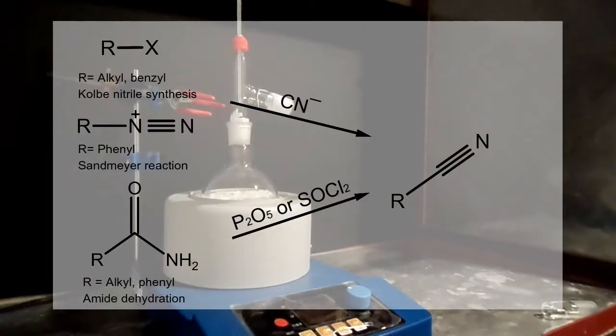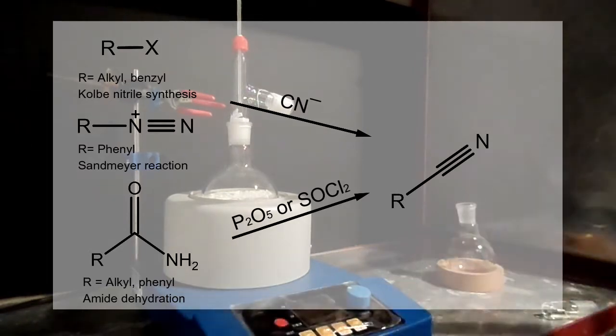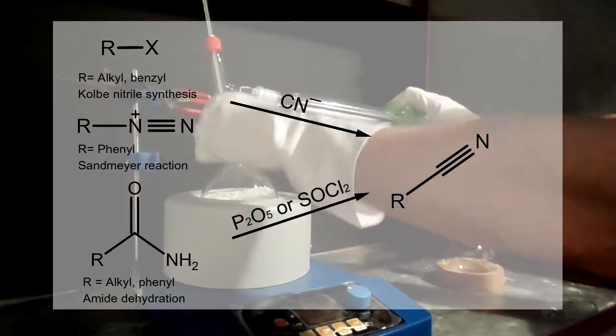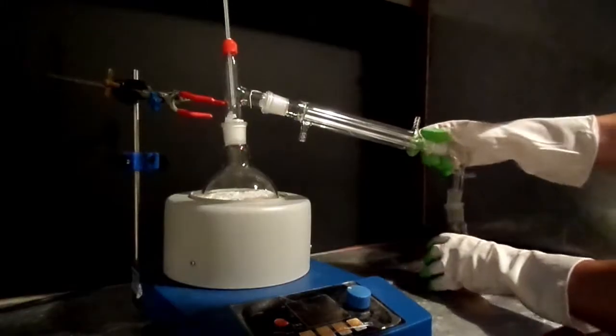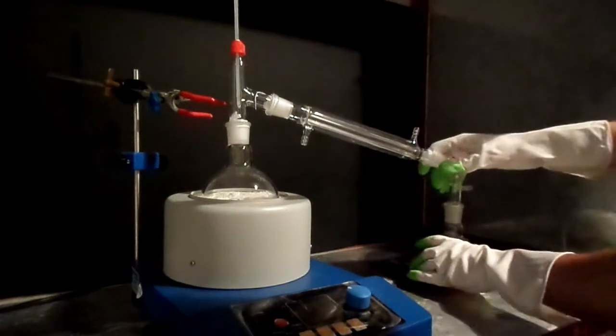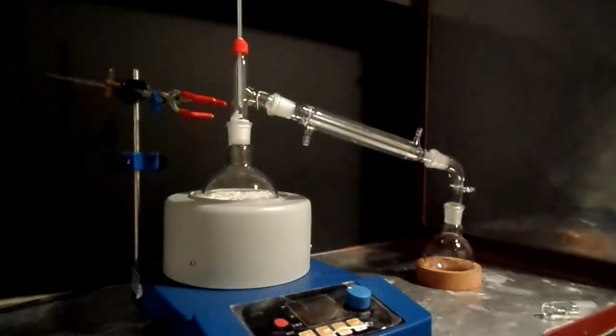Typically benzonitrile and related nitriles are produced using either toxic cyanide salts or from the reaction of amides with strong dehydrating agents such as phosphorus pentoxide. Other routes exist, but generally forming a nitrile is not easy nor safe for home chemists.